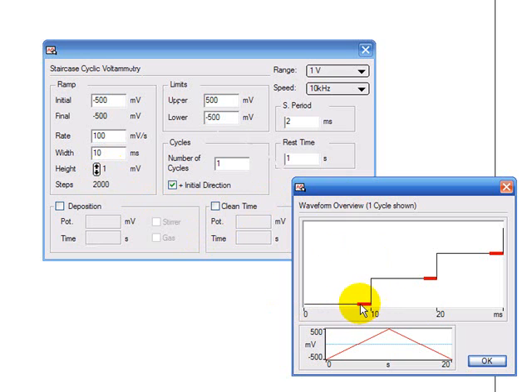The red part is the sampling period, this is when the software records the current and at the moment it's been set to 2 milliseconds.